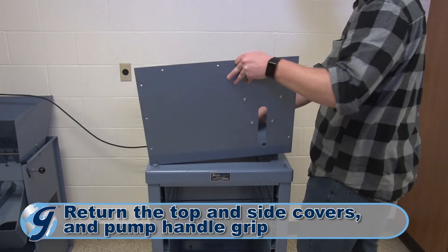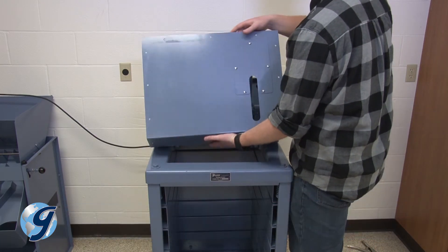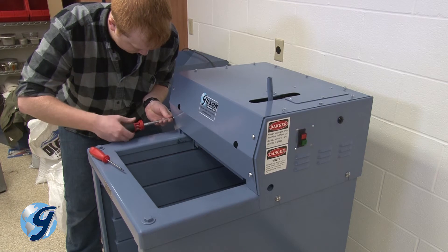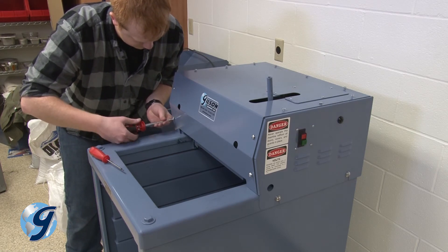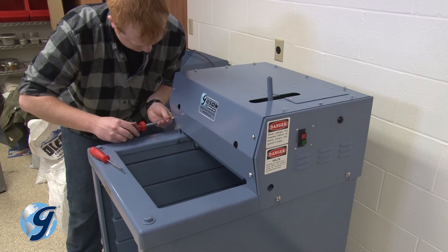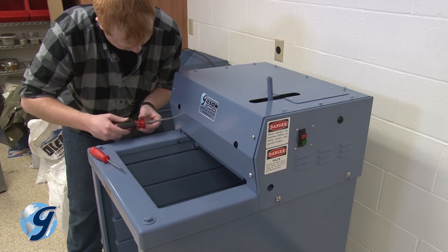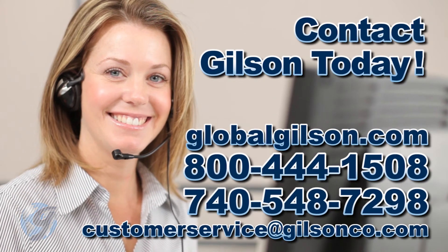Now, return the top and side covers and the pump handle grip. After fully reassembling the unit with covers installed, run the unit empty for a few minutes. The Gilson testing screen should run freely and quietly. For any questions about the hydraulic system of your Gilson testing screen or for any Gilson product, please contact your Gilson technical support team.